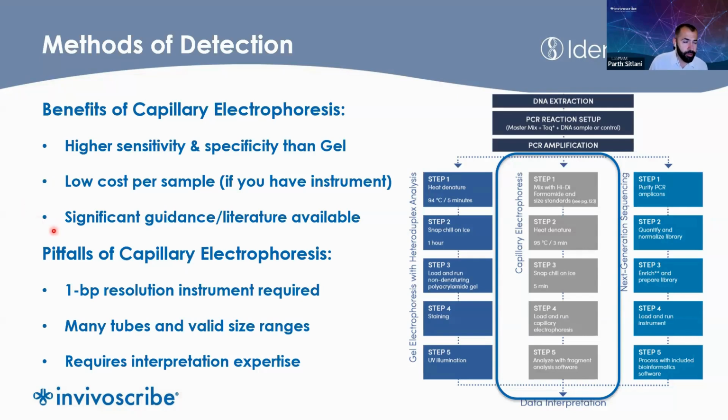Another big benefit of capillary electrophoresis is that it's been very well standardized. Invivoscribe was involved with the BIOMED-2 EuroClonality group for development of the standardized clonality detection process. And that process is now over 20 years in standardization. So there's quite a lot of literature and guidance available for showing example results and how to do the interpretation.